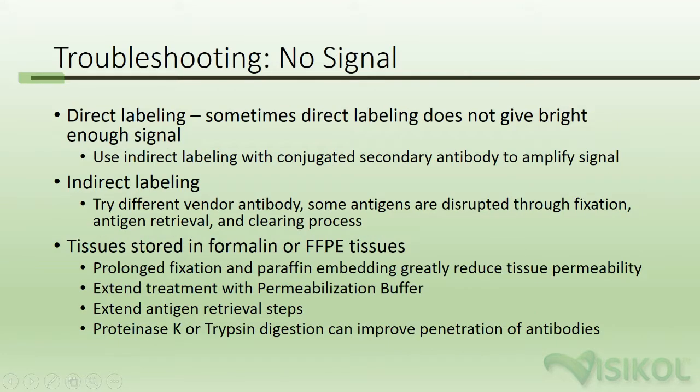What do you do if you see no signal? If you've used direct labeling, direct labeling sometimes does not give bright enough signal for three-dimensional labeling; you should use indirect labeling with a conjugated secondary antibody to amplify the signal. If you've used indirect labeling, you should try a different vendor's antibody. Some antigens are disrupted through fixation, antigen retrieval, and the clearing process and are not compatible with Visicol Histo. Please see our website for a list of antibodies that have been validated with Visicol Histo.